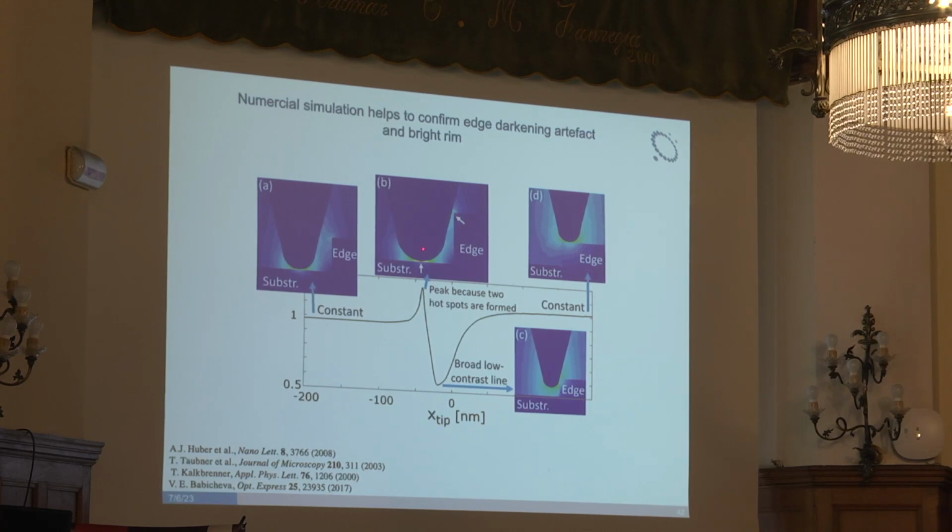But now, there's this situation where this peak appears, and what they calculated here is, I think, really the scattering from the tip. But in the near field, we see that there is interaction now between the tip apex and the substrate, one hotspot, or one strong interaction, and there's another one between the tip shaft and this very sharp edge here. And so they say here the interaction is strongly enhanced because of tip-substrate coupling plus tip shaft-edge coupling, okay? But I think this also requires further systematic modeling, but I think it fits quite well.